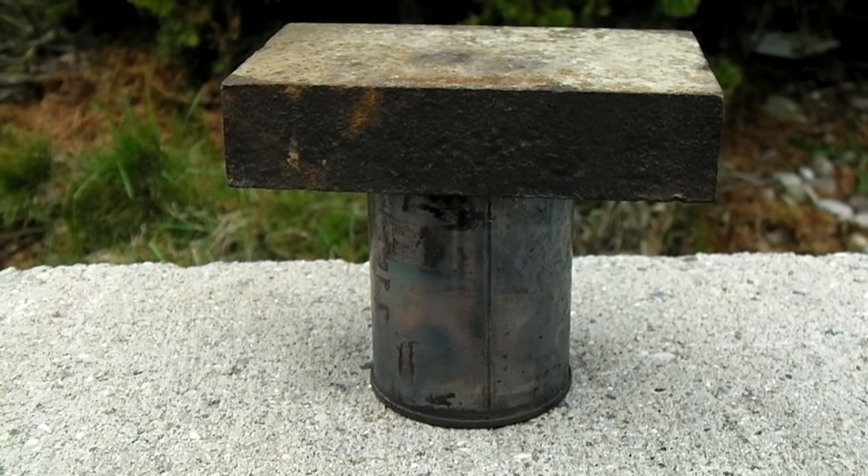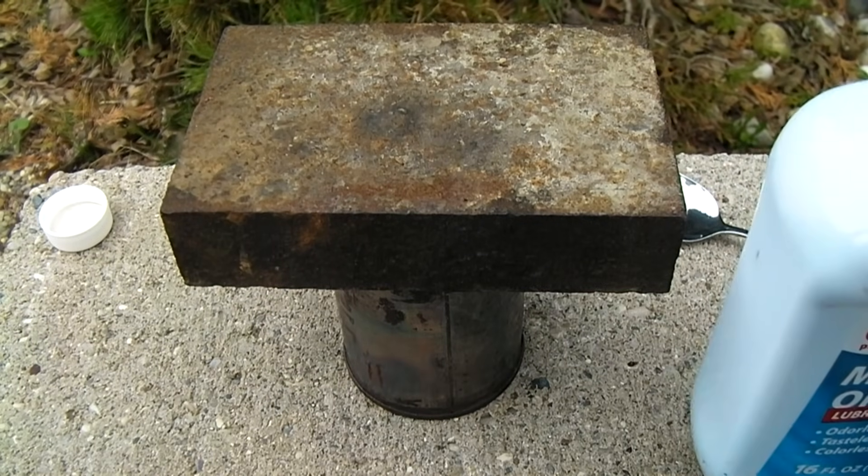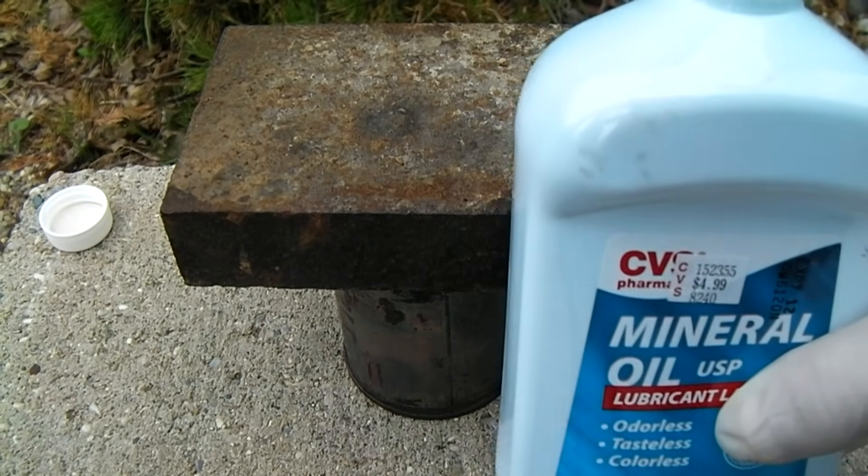The crucible must now be left to cool for at least 10 minutes. After 10 minutes of cooling, the lid can be removed and mineral oil poured inside.